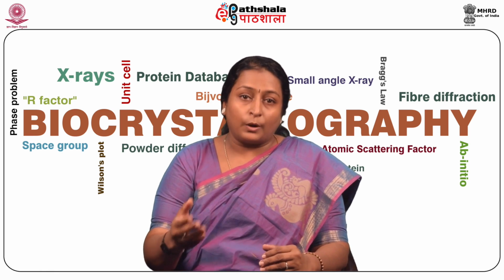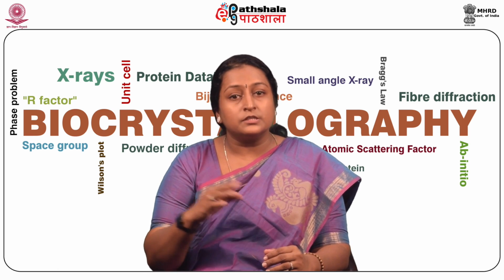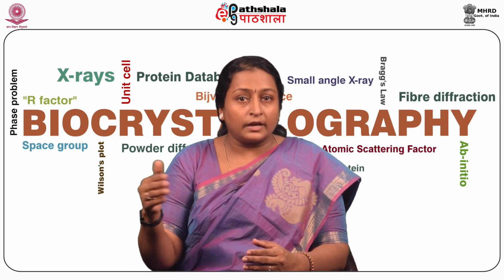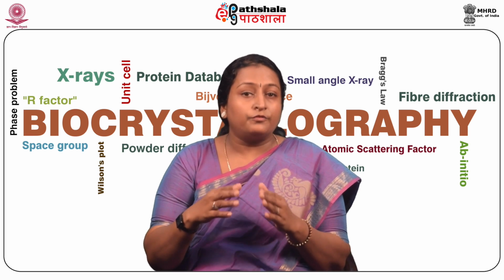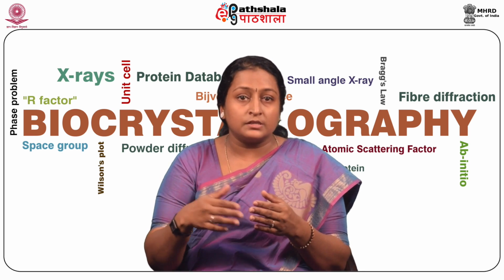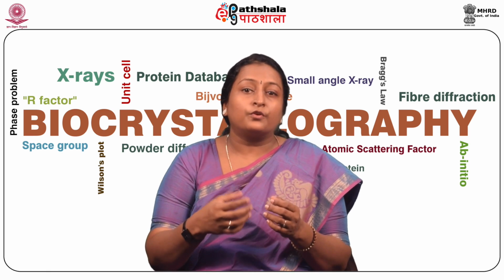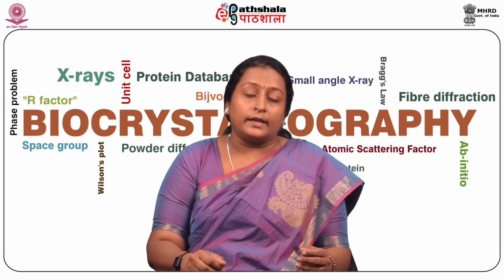In the powder diffraction method, a single wavelength of collimated X-ray beam is incident on the powder. The diffracted beams are subsequently absorbed by the detectors. The resulting diffracted beams can be measured and the corresponding d-spacings are calculated. The final results are generally given as intensity versus d-spacing or intensity versus 2 theta. Modern diffractometers are computer controlled, which allows for fast and efficient data collection and also data analysis.